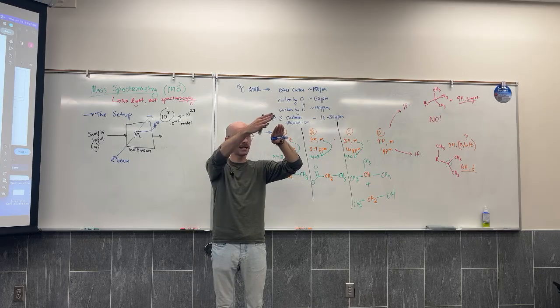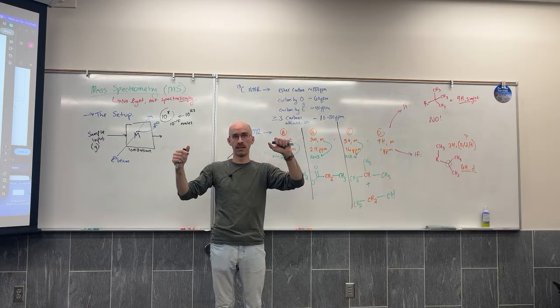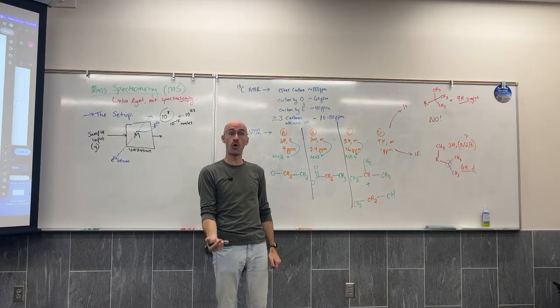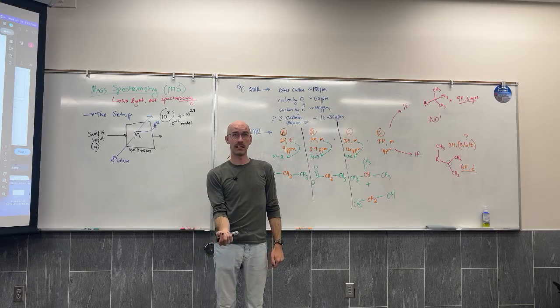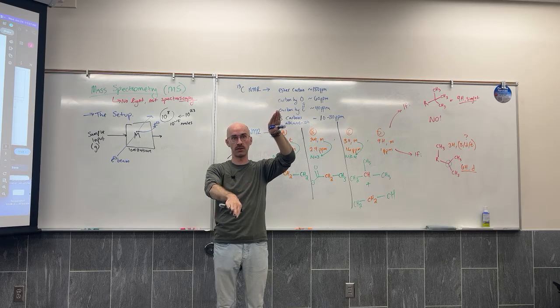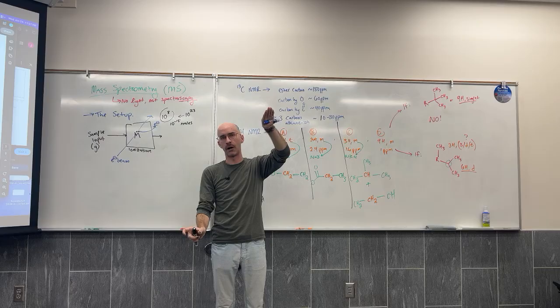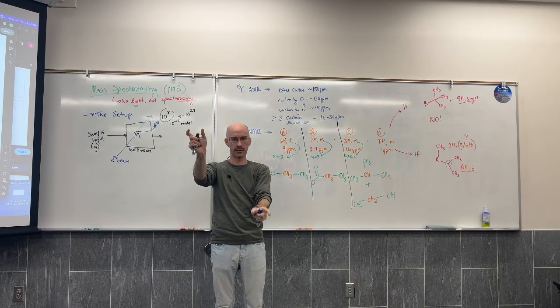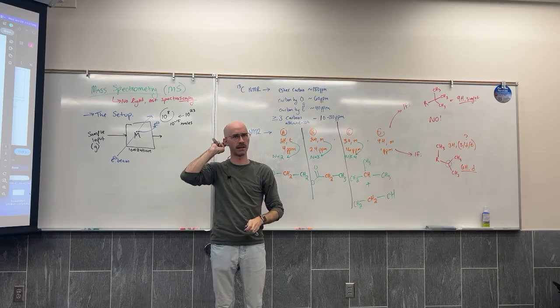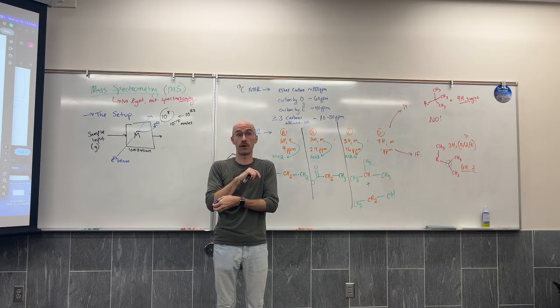And then high energy electrons, again, don't do much to a molecule. So there's kind of this sweet spot, depending on what you want to do to a molecule. Do you want to eject one of the core electrons? You actually would use this sweet spot in the middle. Do you want to eject not a core electron, but an outer layer electron? You could use either range outside of that. So they're kind of high energy, but not necessarily super high energy.